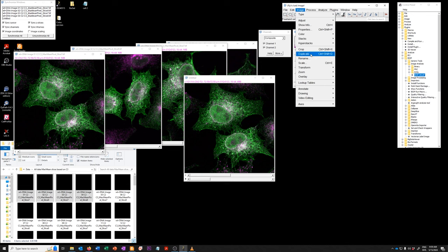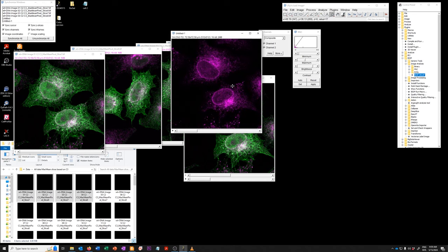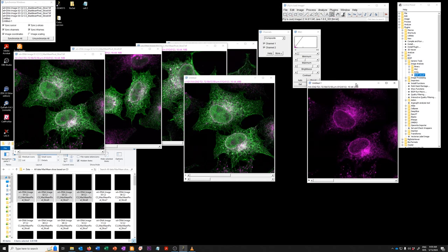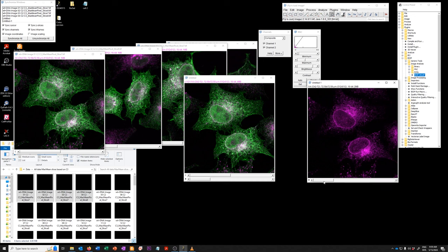And just to remind you, it's an image duplicate, control shift D. For example, you may want just one of those channels. So here you have a single channel view of these four.